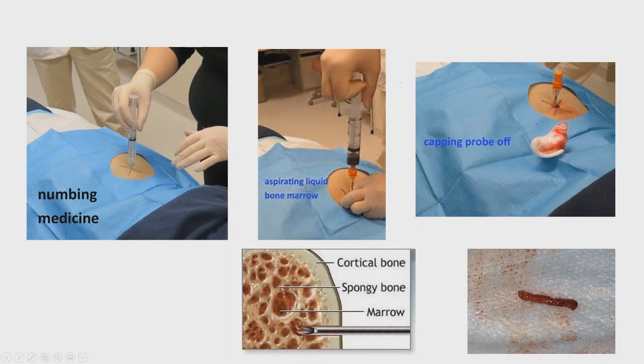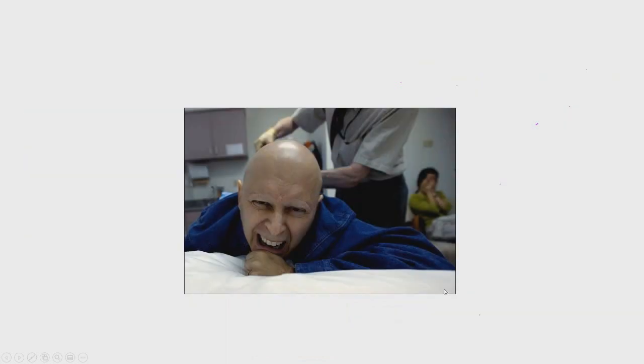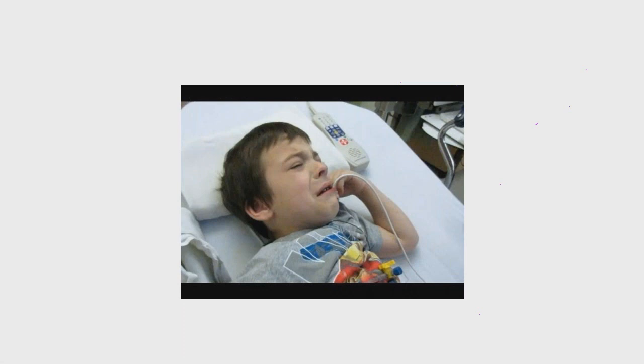Why is this so important? Because, as I said before, this is a very painful process. And even though they use anesthesia and surface deadening and so forth, it's still painful. So imagine this with children who have some type of degenerative bone disease or whatever, and them having to go through this. So it behooves the technologists to be as professional as they can when they're handling these specimens, because of what the patient had to go through.